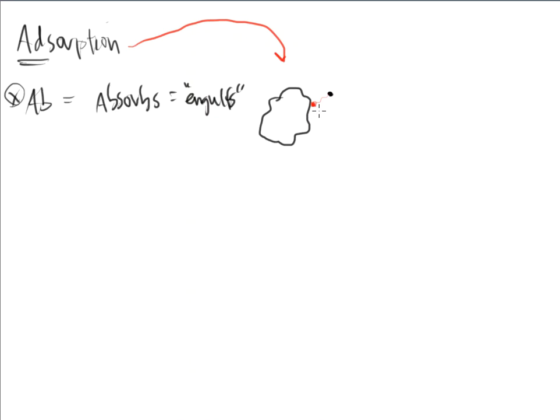But imagine this molecule being covered in that sticky fly paper. So that's really what stationary phase is. It's this molecule that we'll get into in just a second. And on the outside surface, we have this sticky fly paper, right? And the molecule will come in and it will stick to the surface temporarily. And then it just kind of leaves and it goes on to the next stationary phase particle.